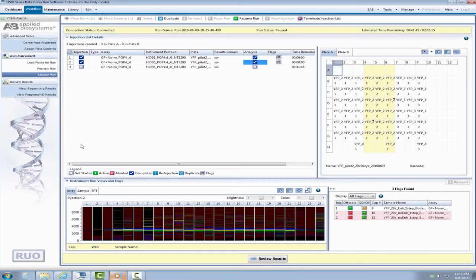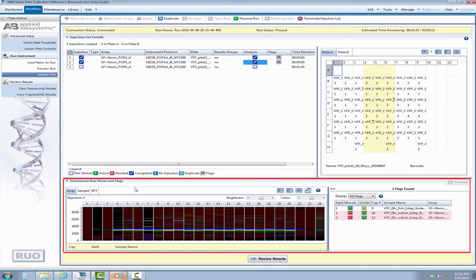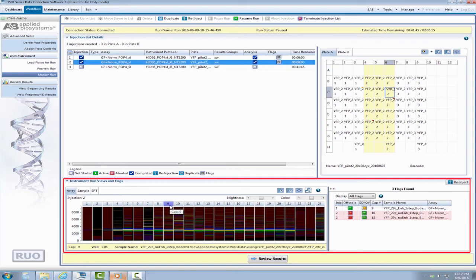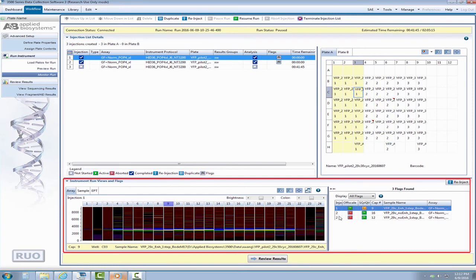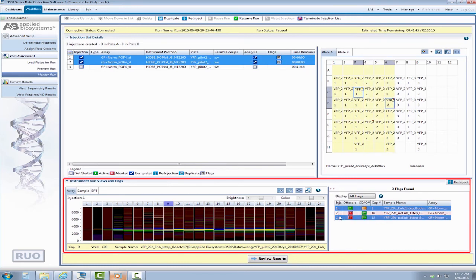But wait, there are other ways to reinject. You can also perform reinjections from the instrument run views and flag screen. On the array tab, select the corresponding capillary number for an 8-cap or 24-cap array. Alternatively, the flag table displays a quick preview of sample quality and identifies samples that may need investigation. If you would like to reinject samples that have been flagged, you can select the samples directly from this table. Remember to hold control and click if you would like to make multiple selections prior to hitting reinject.